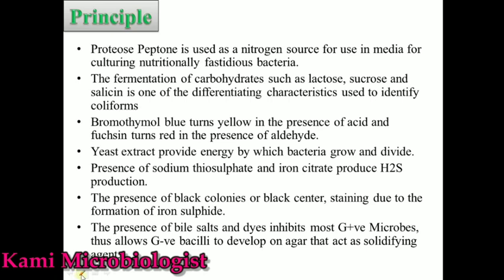Now let's talk about the principle of this media, meaning the most important function of the ingredients present in it. First of all, we have proteose peptone, which acts as a nitrogen source, especially needed for the growth of fastidious bacteria. Then we have carbohydrates like lactose, sucrose, and salicin, which are used for the identification of coliform bacteria.